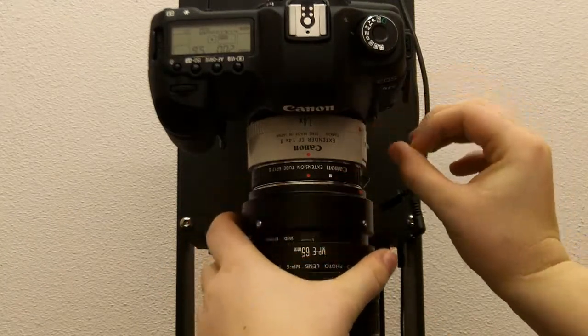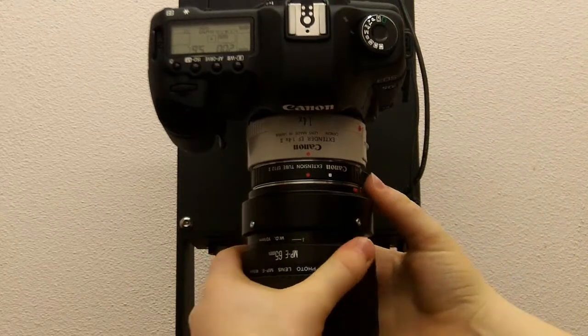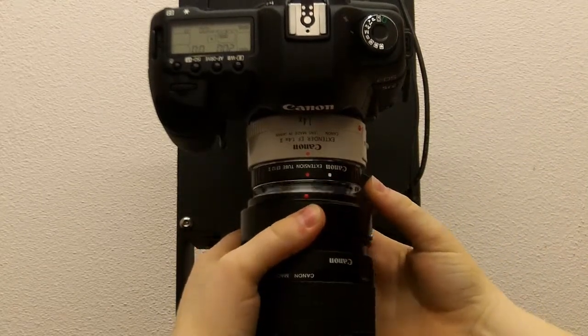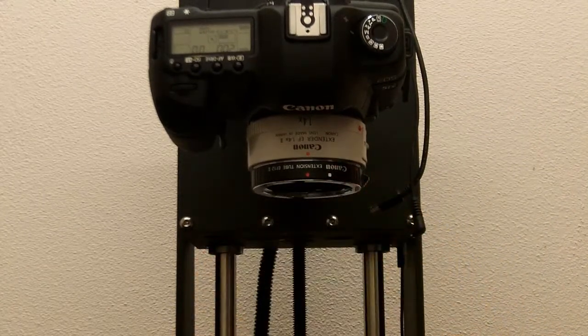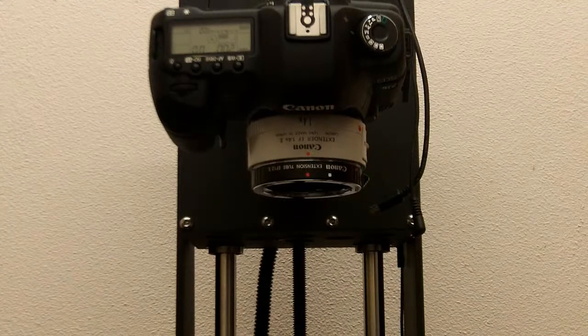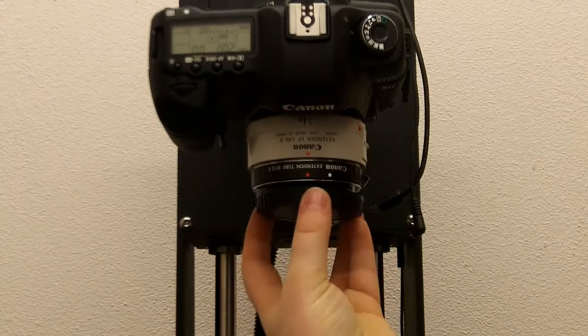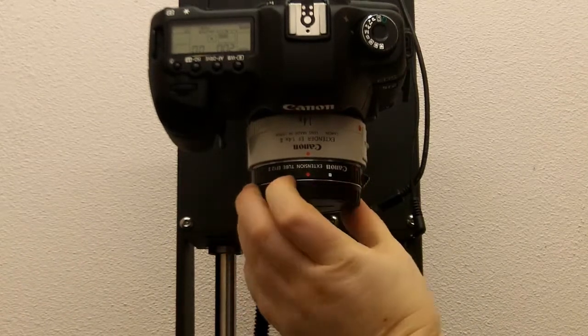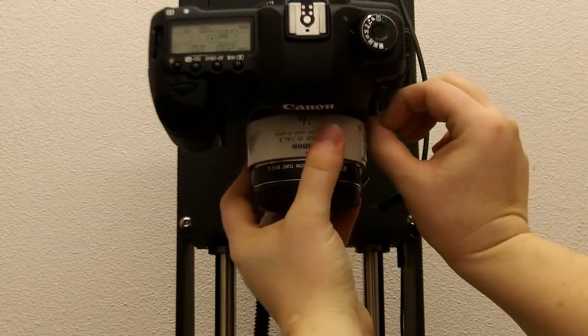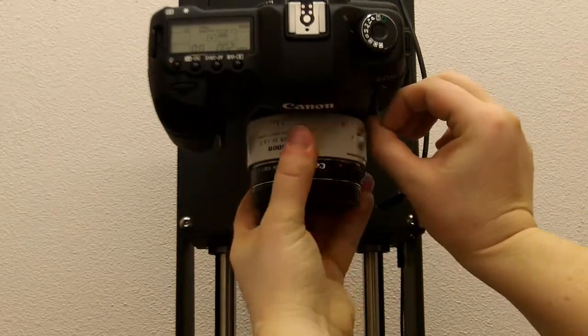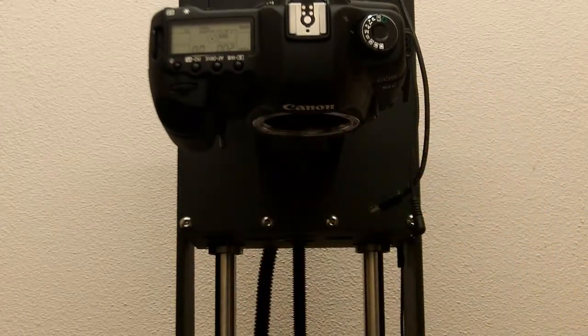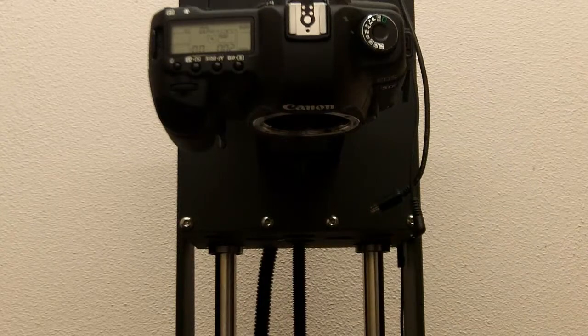So, let's take this apart. There's a side release button. Turn the 65mm until it releases. And then press the side release button to take off the teleconverter. And then set aside.